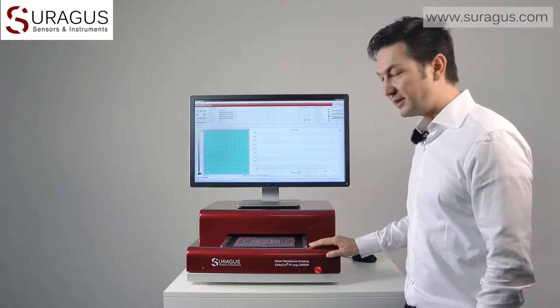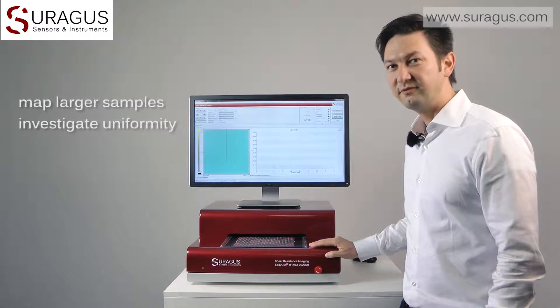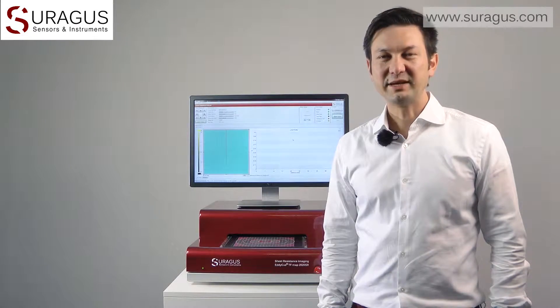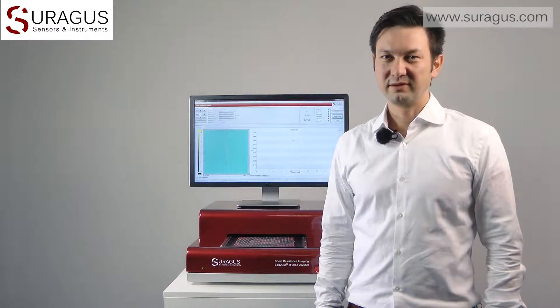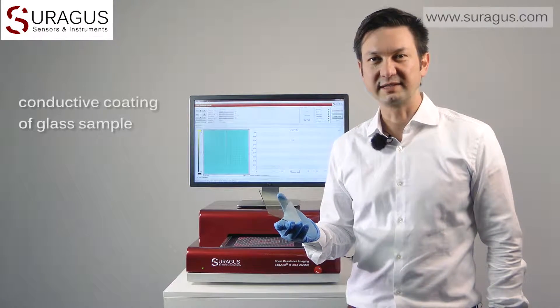Welcome, my name is Martin Busch and today I'm going to introduce the ZURAGUS non-contact sheet resistance mapper. This mapping device is a very handy and comfortable tool since it allows to map larger samples and to investigate the uniformity of electrical properties. In this case we would like to know more about the uniformity of the conductive coating of this glass sample.